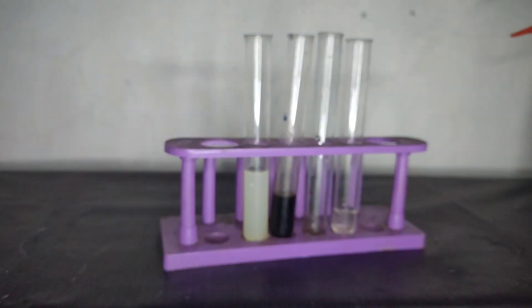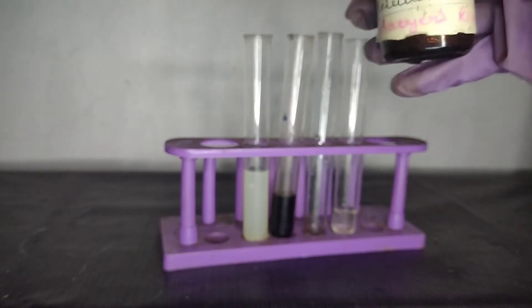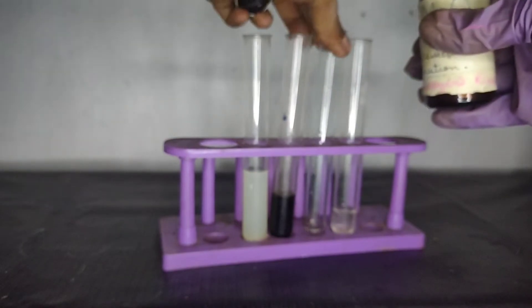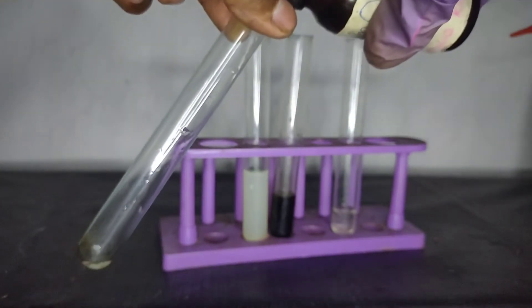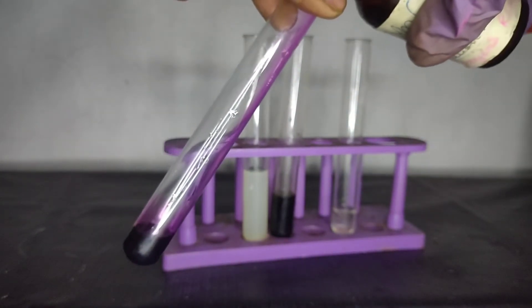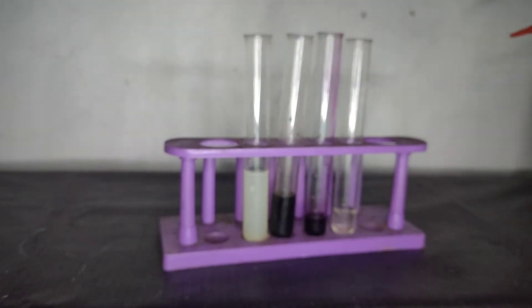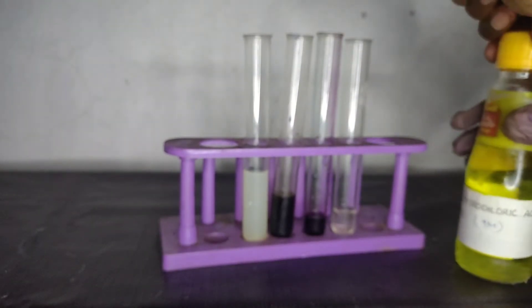Now to this, we need to add chlorine water. So to prepare it, we take potassium permanganate solution into a test tube. Now to the potassium permanganate solution, add some concentrated hydrochloric acid.